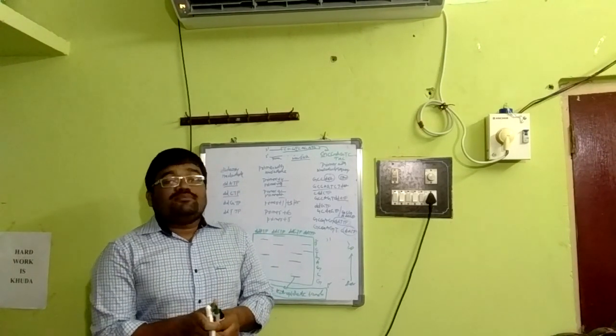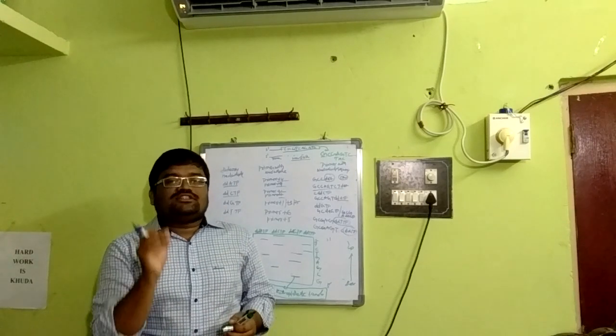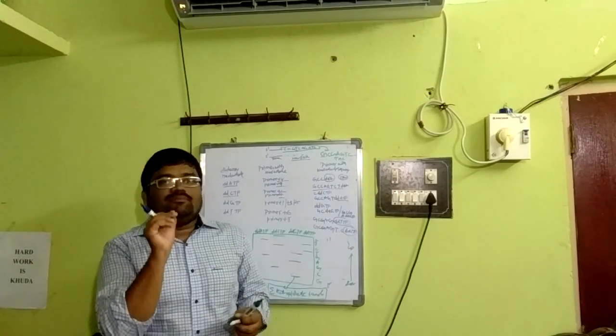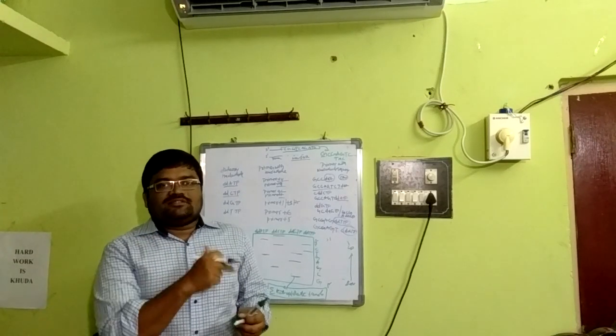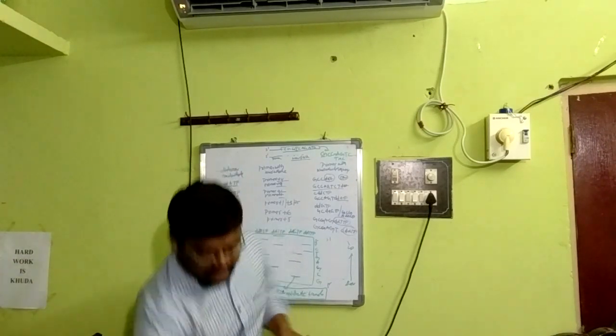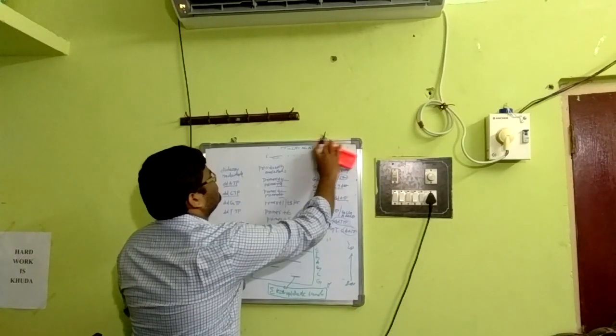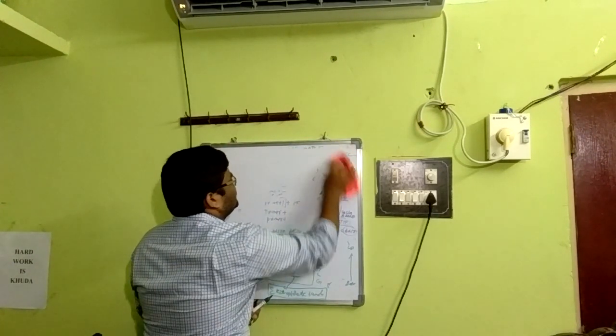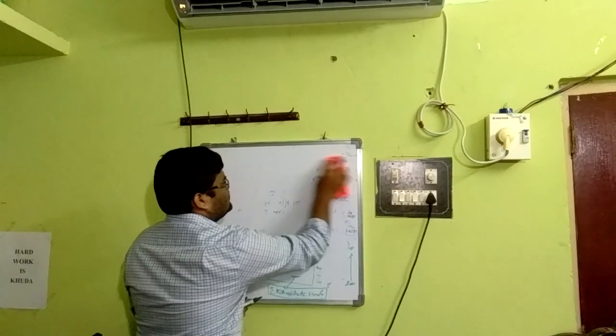dideoxynucleotide. This is very important because on average a DNA fragment of 350 base pairs will be determined by this method. Okay, the last one, the most advanced, a modified version of the dideoxy method, is called automated DNA sequencing.